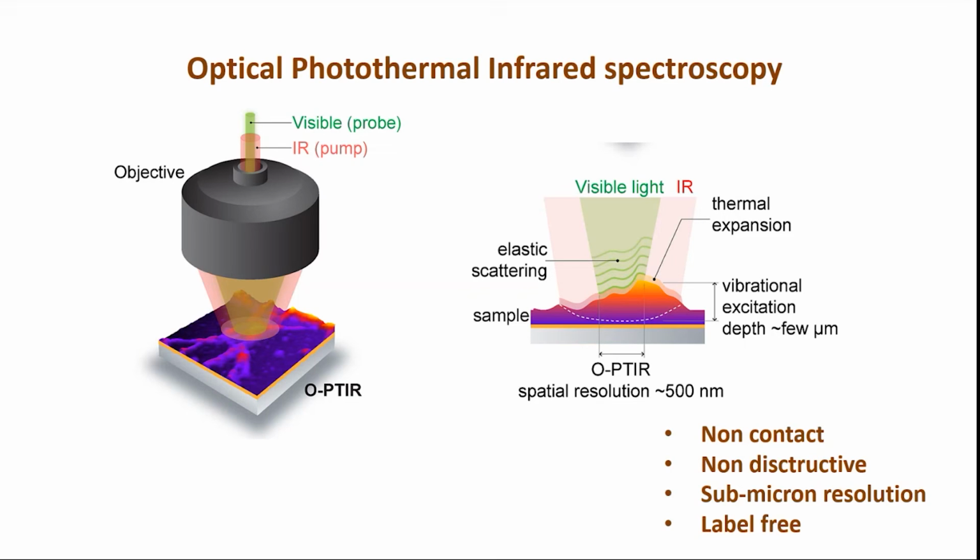For example, after scanning tissue with OPTIR, it is possible to do other spatial techniques like proteomics or transcriptomics. And that gives not only spectra, it also helps to interpret the spectra and understand biological phenomena in a more detailed way.